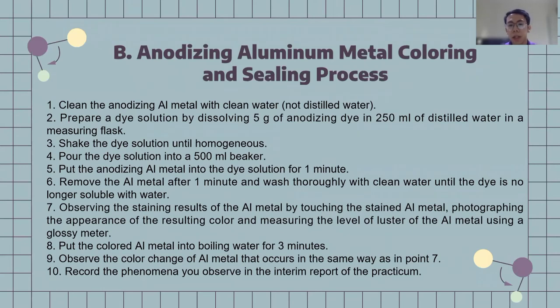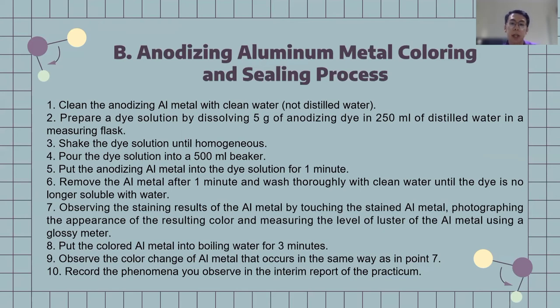Anodizing aluminum metal coloring and sealing process: first, clean the anodized aluminum metal with clean water, not distilled water. Then prepare a dye solution by dissolving 5g of anodizing dye in 250 ml of distilled water in a measuring flask. Shake the dye solution until homogenous and pour it into a 500 ml beaker glass. Put the anodized aluminum metal in the dye solution for one minute, then wash thoroughly with clean water until the dye is no longer soluble with water, because if the dye is soluble with water it will vanish.